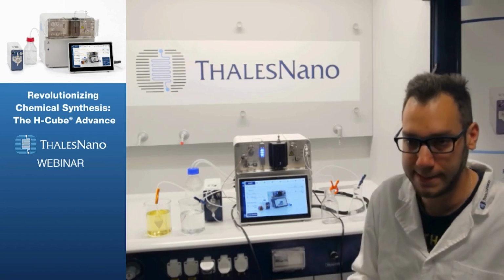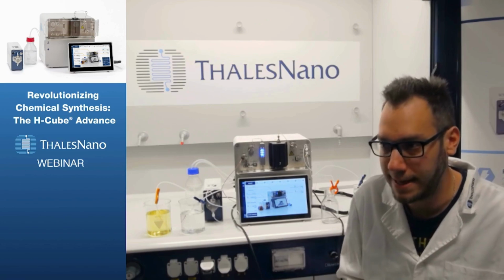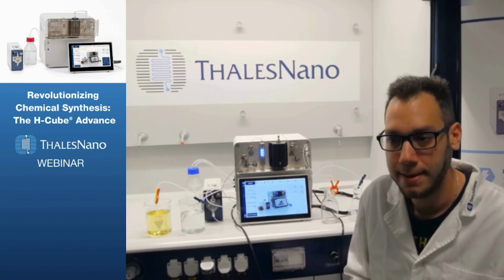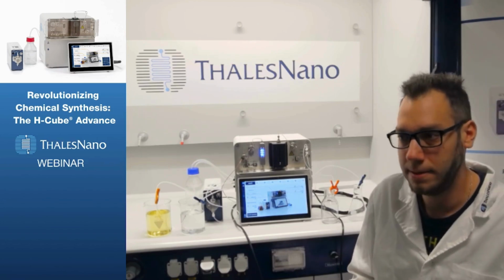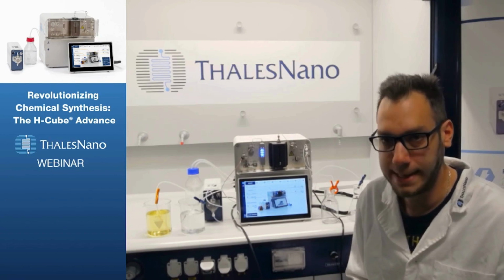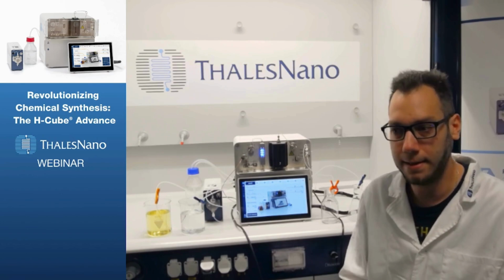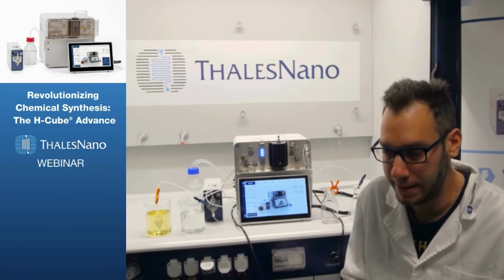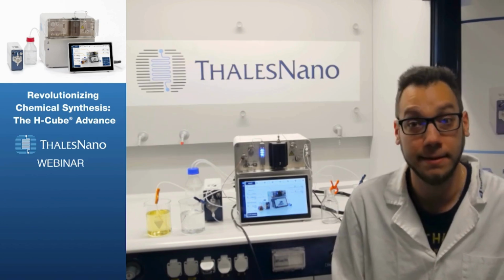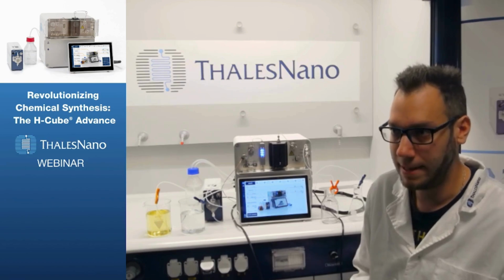So there's a little bit of resistance in the gas liquid mixer, and it's not easy to inject a gas into a stream of liquids. So therefore, to overcome this difficulty, the cell needs to produce a couple of bars extra pressure compared to the liquid pressure. So that's why the cell is allowed to reach 130 bars of hydrogen pressure. That will be more than sufficient to maintain the 100 bars, which is the capacity of the instrument itself, the reactor zone.